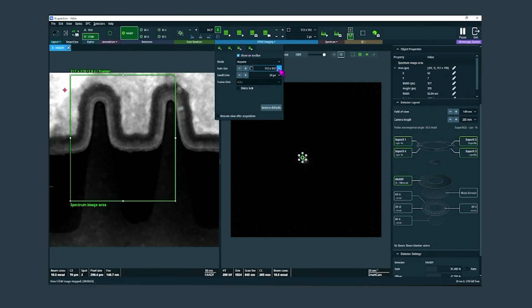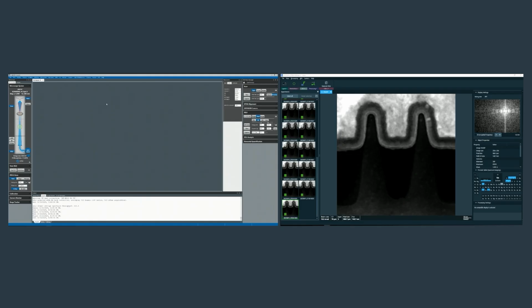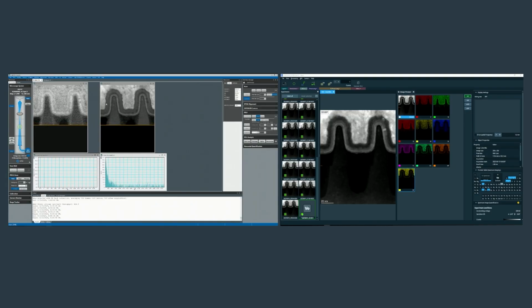On our next example device, a quick change of settings enables a different method for in-depth elemental mapping, electron energy loss spectroscopy, which details not just chemical constituents, but bonding states as well. With Velox software, we can go from a quick and easy imaging setup to efficiently gathering EELS and EDS data at the same time for complementary insights in just minutes. Multi-frame, drift-corrected data is just that easy.